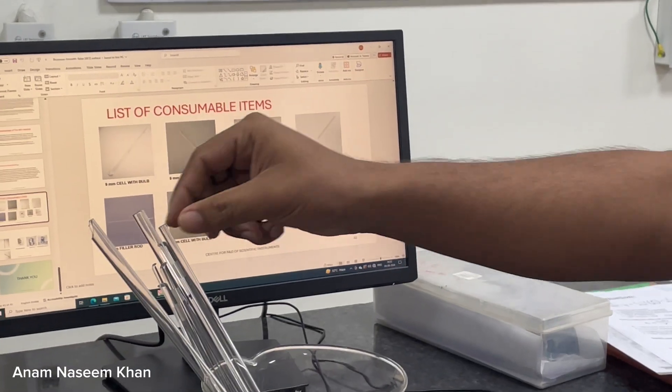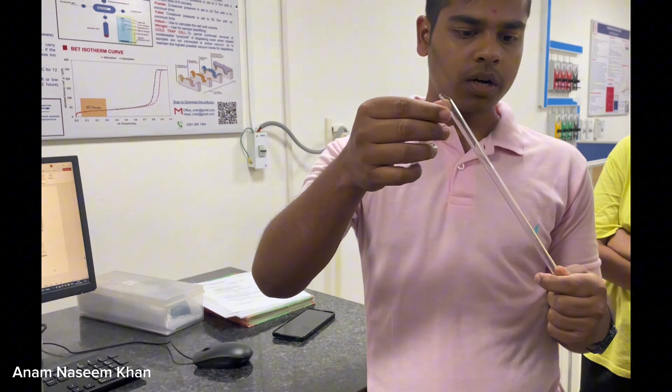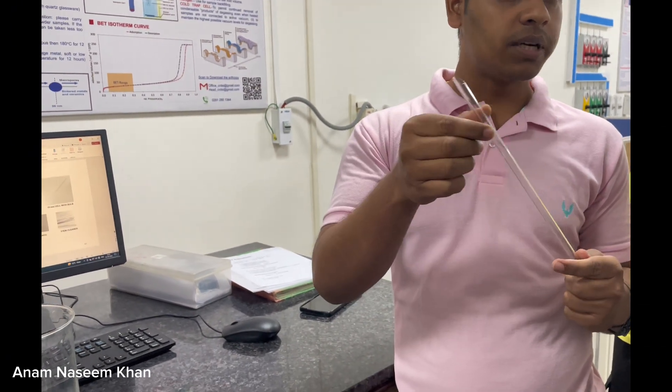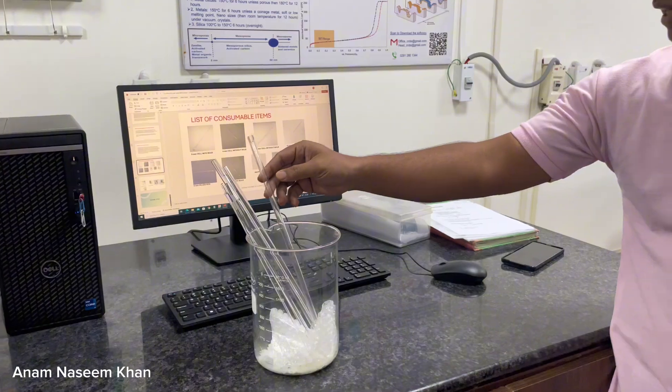After putting the sample in, particles can attach to the rod of the tube, so we have to clean it completely. That is why we use a stem cleaner to clean the tube rod thoroughly.